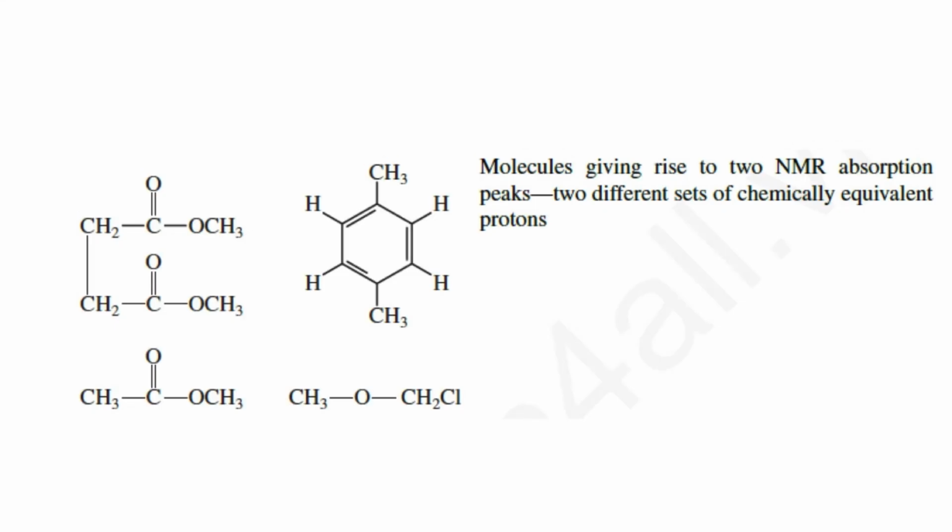On the other hand, a molecule that has a set of protons that are chemically distinct from another may give rise to a different absorption peak from each set, in which case the sets of protons are called chemically non-equivalent. And so the following are examples which should help to clarify these relationships.